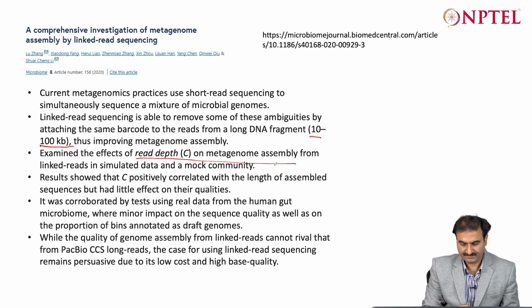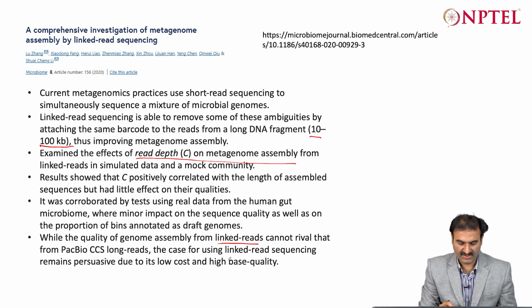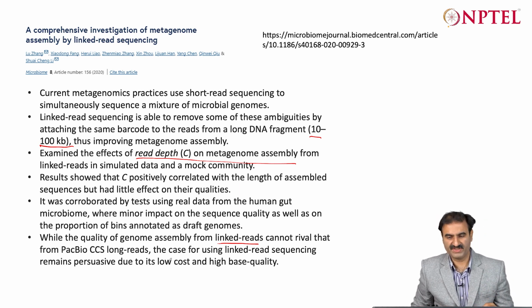Ultimately, they showed that the final assembly generated by linked reads was not similar to PacBio long reads, but it was better in the sense that PacBio is a very expensive technology. By using linked reads and short read technology, which is much cheaper than PacBio, a reasonable quality assembly, which is high quality as well as low cost, could be achieved.